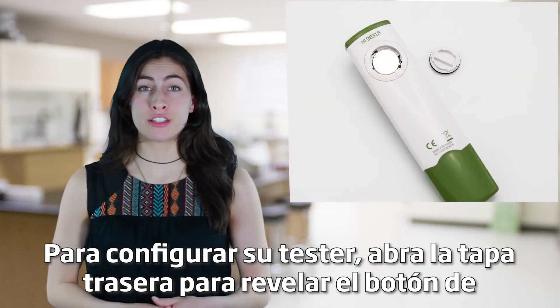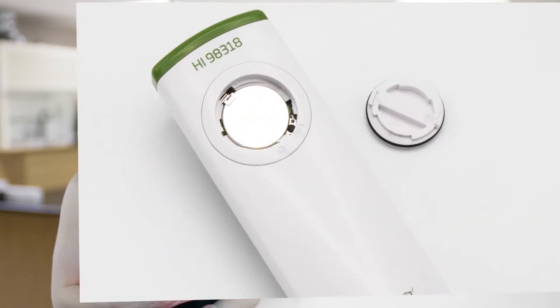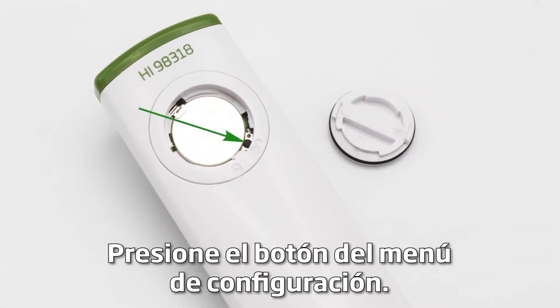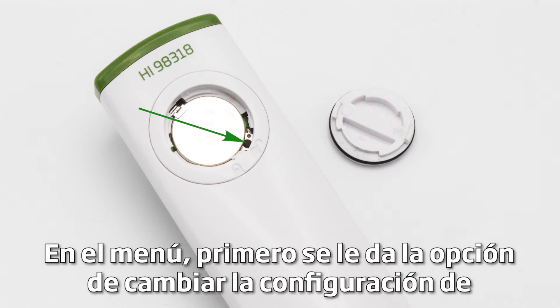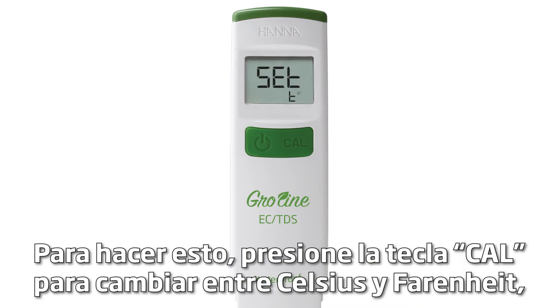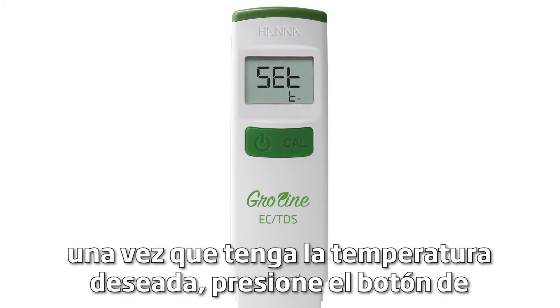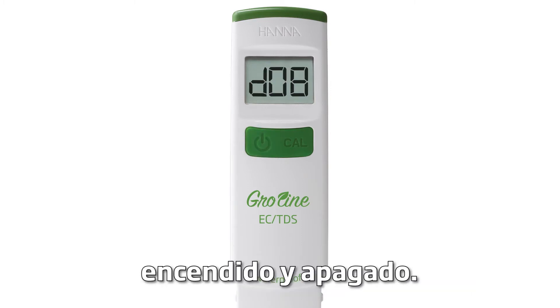To set up your tester, open the back cover to reveal the setup button inside the battery compartment. Press the setup menu button. In the menu, you are first given the option to change your temperature settings. To do this, press the CAL key to switch between Celsius and Fahrenheit. Once you have your desired temperature setting, press the on-off button.